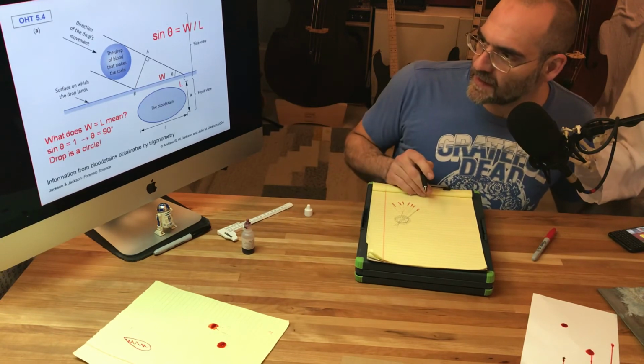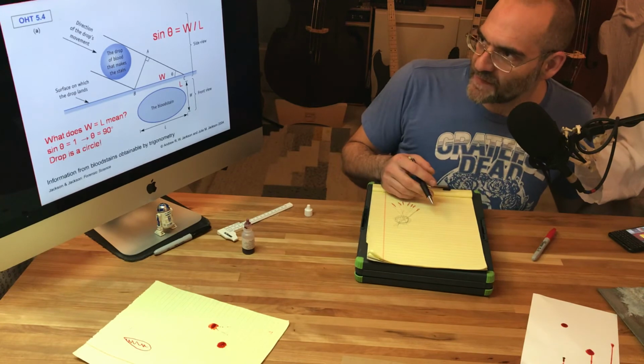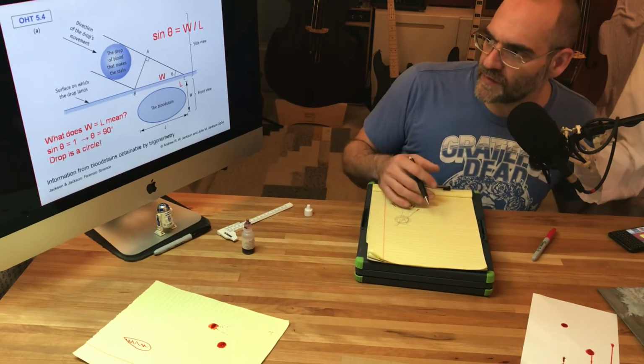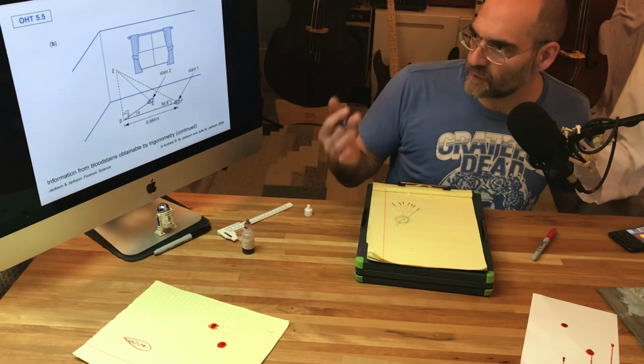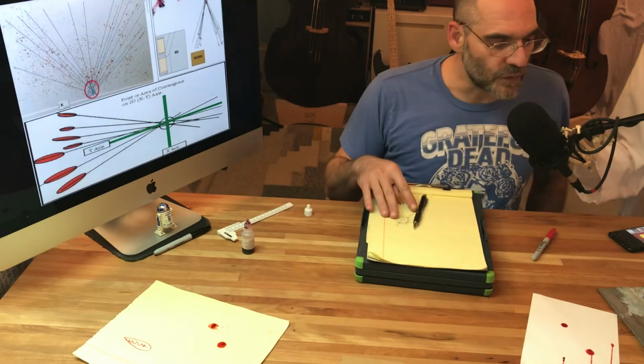We can take a separate video and go over the math of this, but this is usually a one-on-one thing where I have to walk you through on different levels, but I'll try to show you that one as well. And of course we saw that and we did that. So that covers those big four.